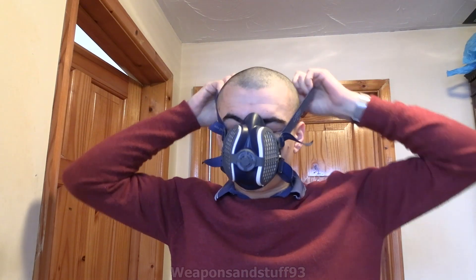Then you have a top strap. What you're going to do with the top strap is put it behind the back of your head. Then put the mask down so it's where it's meant to be on your face, and now you tighten the strap. It doesn't really matter on the order as long as you get done tightening them. You kind of want to do them evenly though — so for every bit you adjust the left strap, you adjust the right strap. The easy way of doing that is just pulling them both at once.